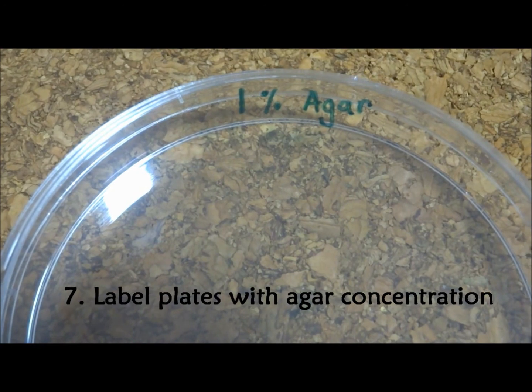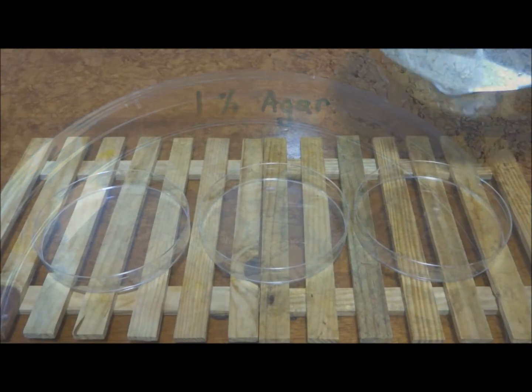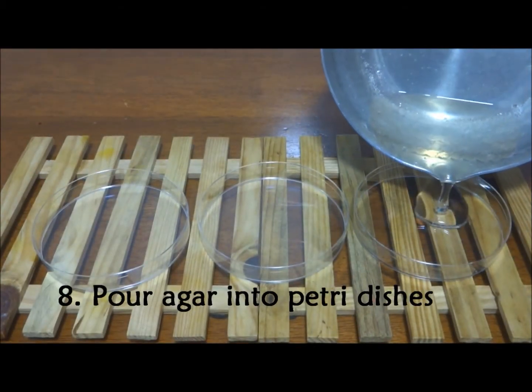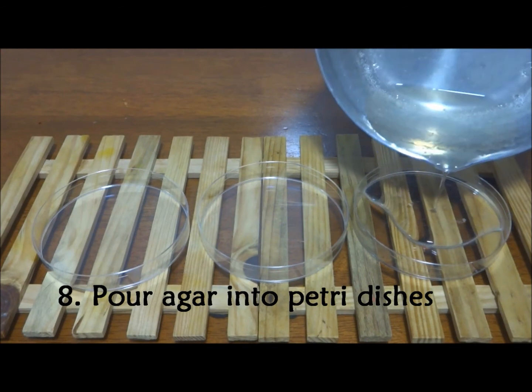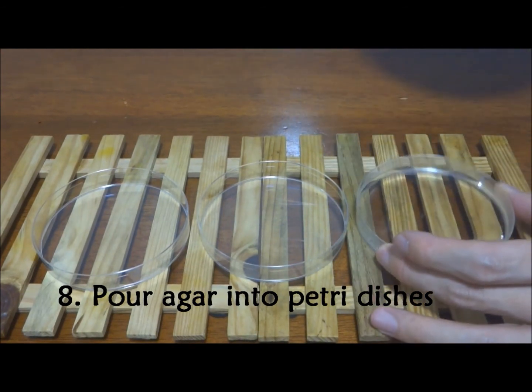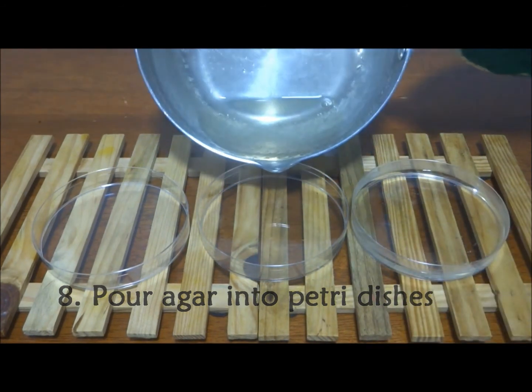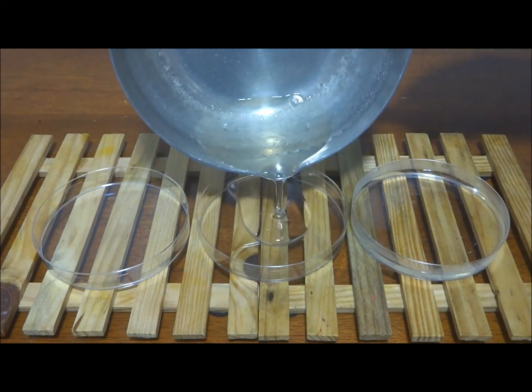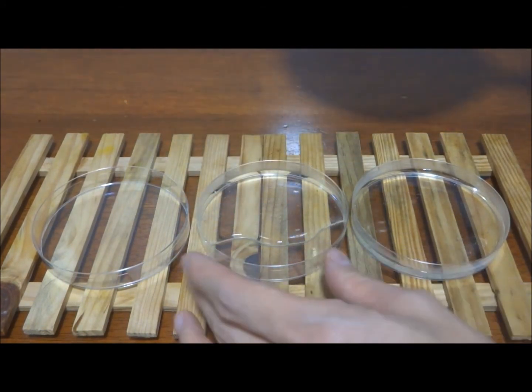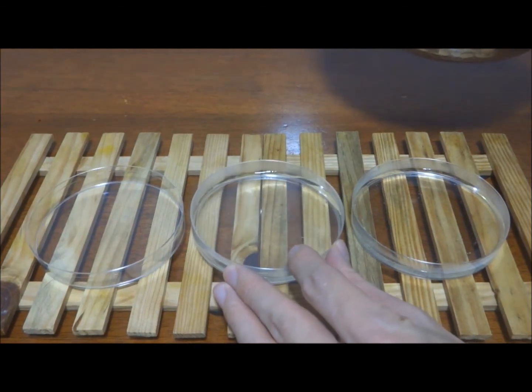Ensure that your petri dishes are labelled with the agar concentration. Pour the molten agar into the petri dishes — each petri dish should be about one-third to half full. Pour the agar slowly to avoid forming bubbles. You may swirl the plate slowly to ensure that the molten agar covers the bottom of the plate evenly. The agar should have an even consistency and appear smooth.